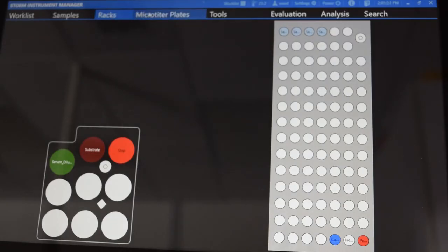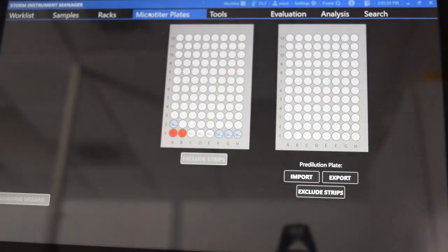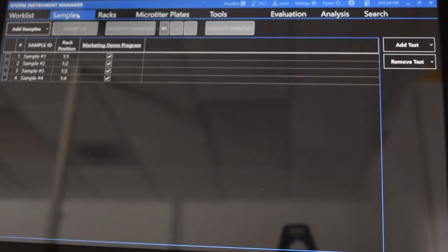Programs for all VMRD assays will be installed on the computer and ready to use. To run a program, simply select the test to be performed from the sample tab.